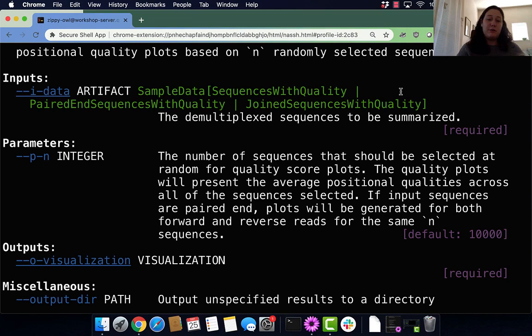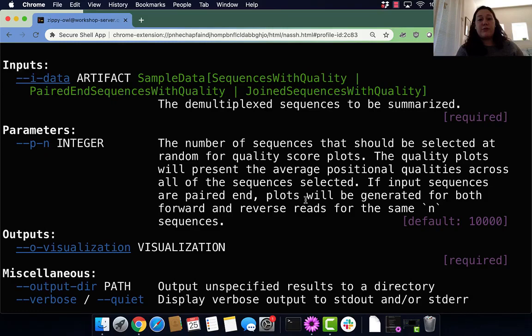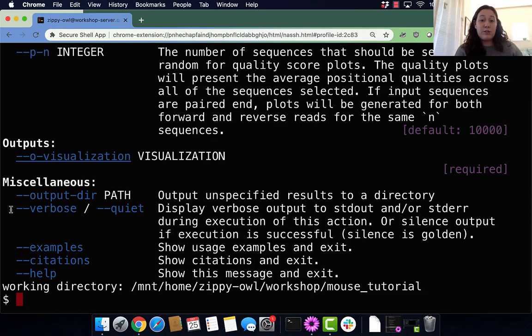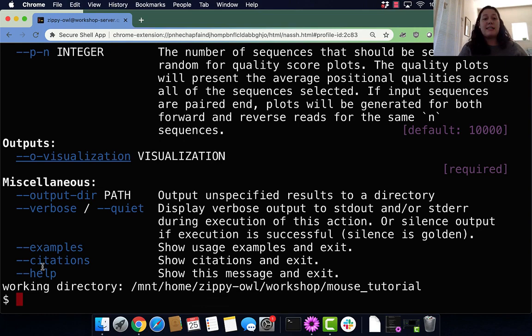This parameter says how many sequences will be selected for the quality plot scores. We're not really going to mess with that. Our output says where our visualization will be and what it will be named. Then there's miscellaneous stuff like output directory, verbose which makes the output more wordy, and quiet which means it says nothing if it runs perfectly.